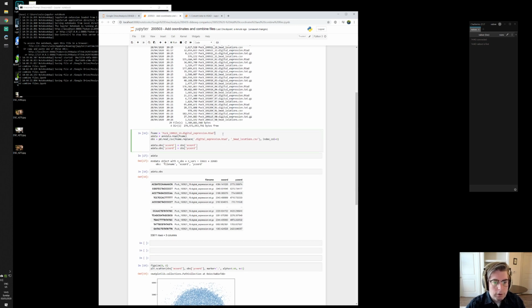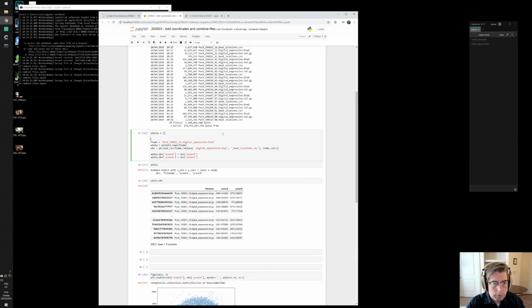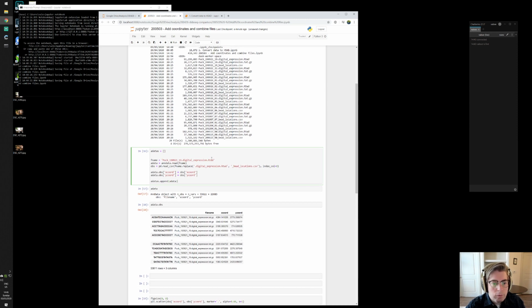So first, put all of the data in a list, and I append each data in this way to that list.